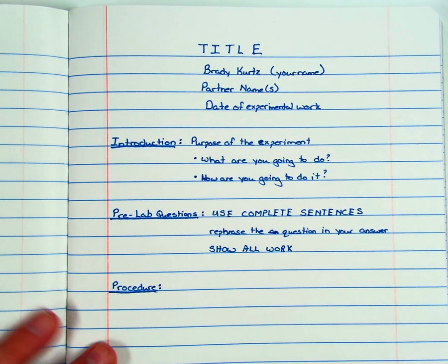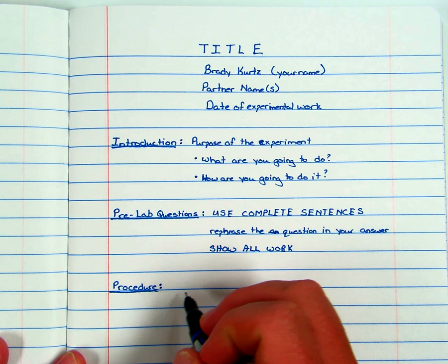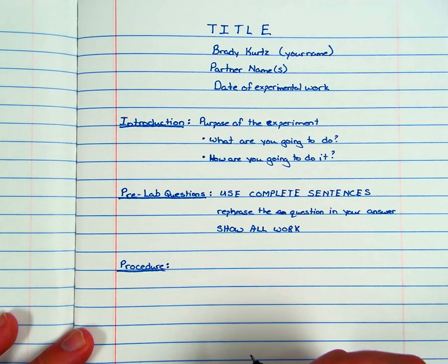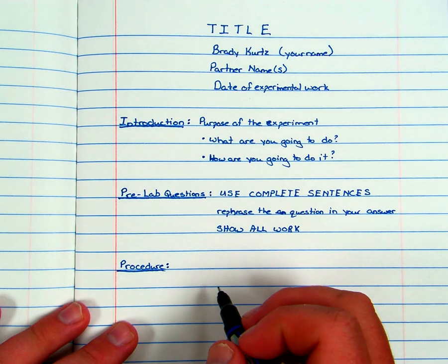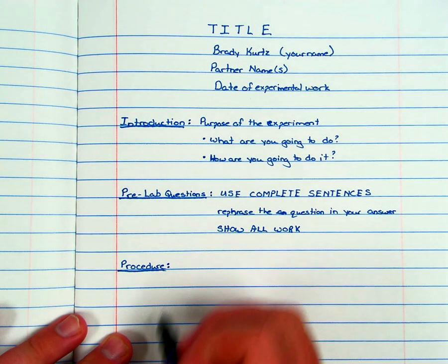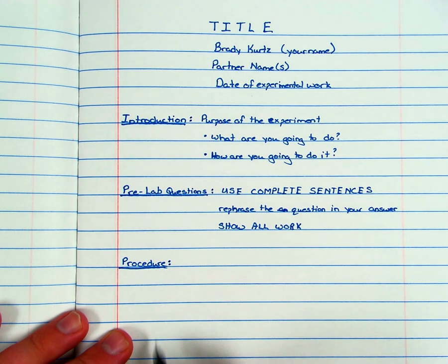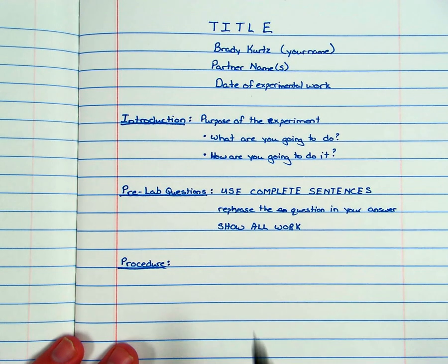So you can go through and write it out by hand. If you want to copy your lab handout, cut it out, and paste it into your notebook, that is also acceptable. If you want to type it up and print that out and paste it in. But no matter how it ends up here, it needs to be the exact same procedure that was given to you. Okay.